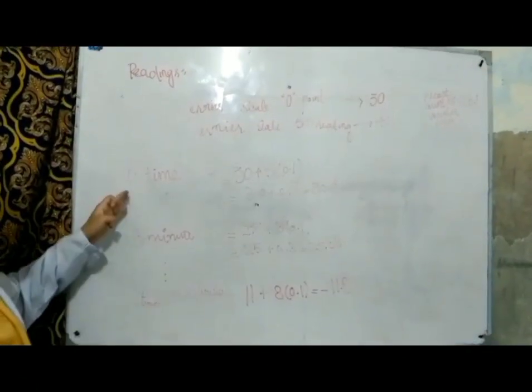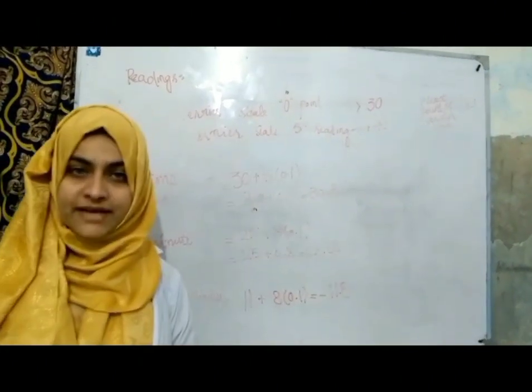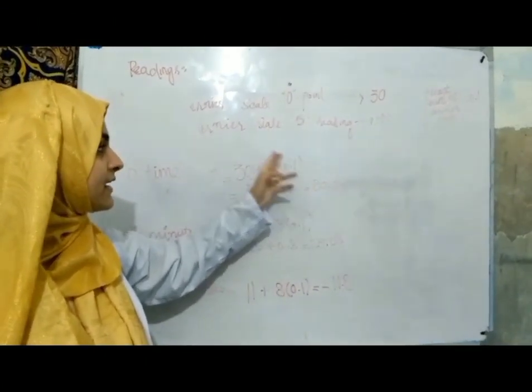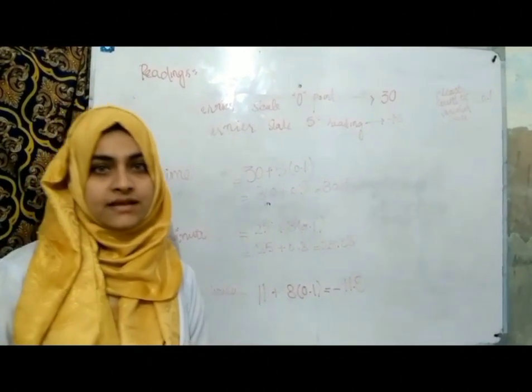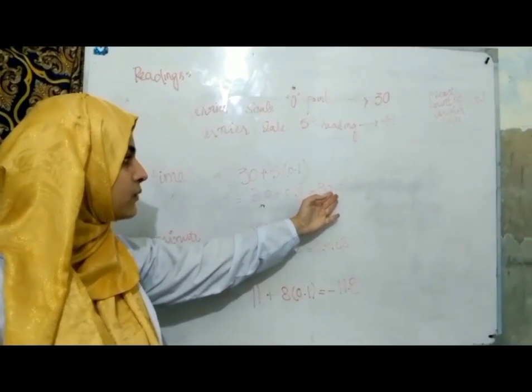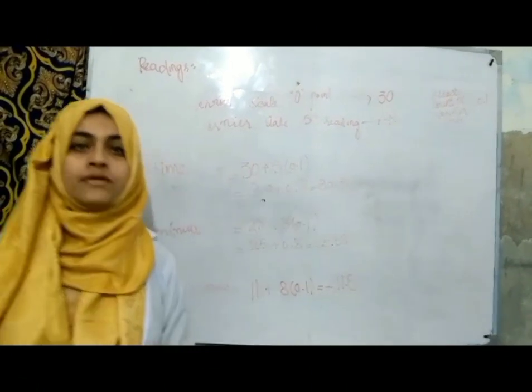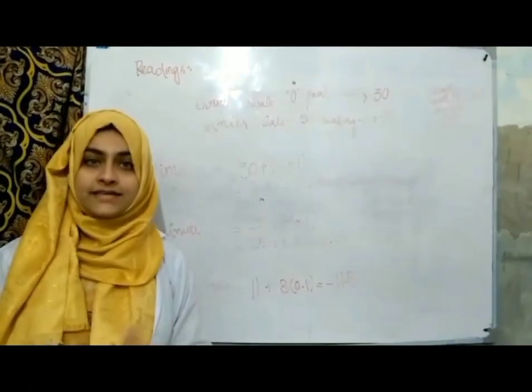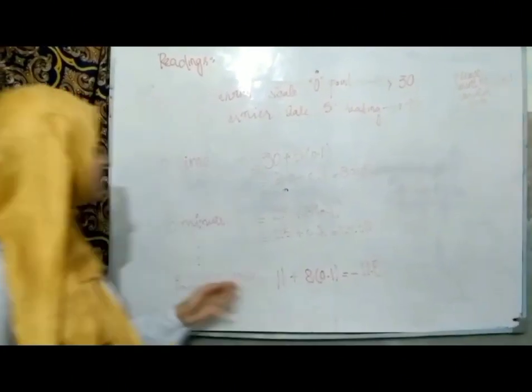Now we will take the reading at 0 time. First, we take the reading of the main scale that is exactly matching with the vernier scale 0 point, plus 0.1, the vernier scale's least count, times the reading of the vernier scale that is exactly matching with the main scale. And then we receive +30.5. Here, the plus sign indicates that the reaction mixture contains a dextrorotatory compound. We came to know about this positive sign by rotating the screw of the polarimeter toward the right.